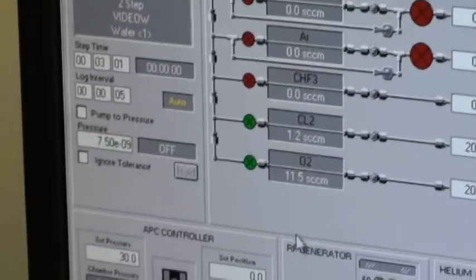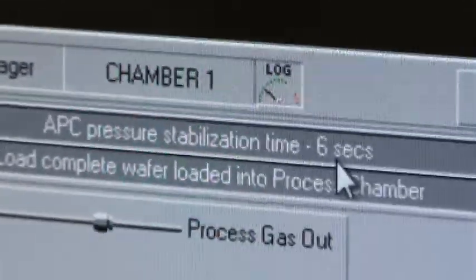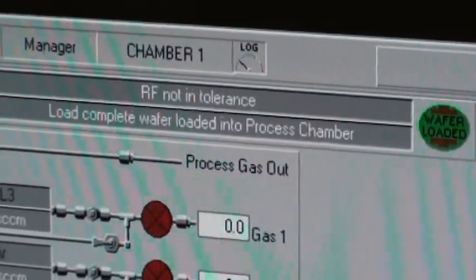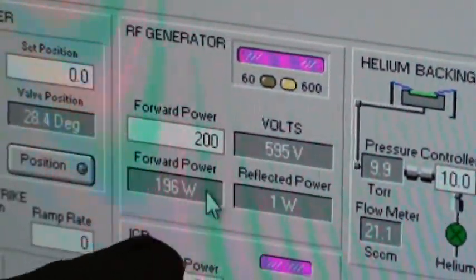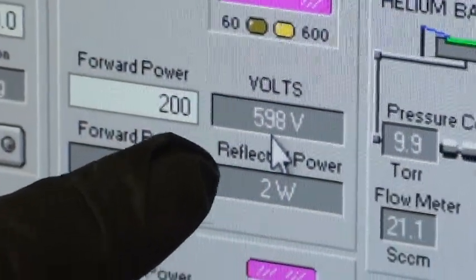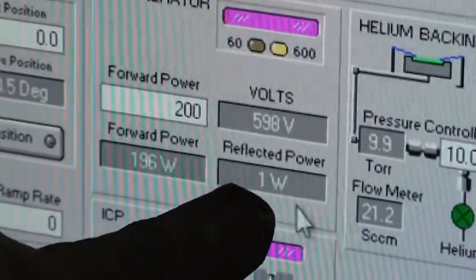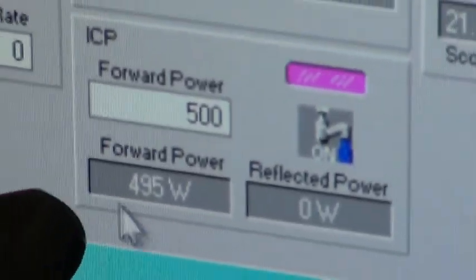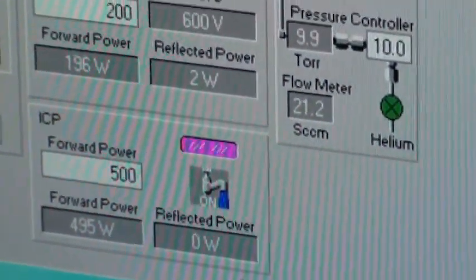Now we're going into the next step. Now it automatically gives it a 6 second timeout, waiting for the pressure control again, because it shuts everything off, turns everything on whenever it skips step to step. Okay now our RF just turned on. 596 volts DC bias. I asked for 200 watts. I have 196, which is very good. We're within 1%. 2 watts reflected. That's the lower. It's the platen power. ICP power. I asked for 500 watts. We have 490, 500, 495. Zero watts reflected. That's very good. Well within spec.